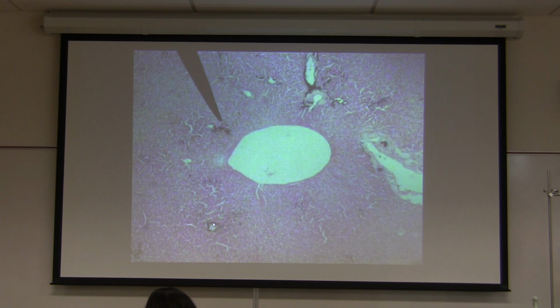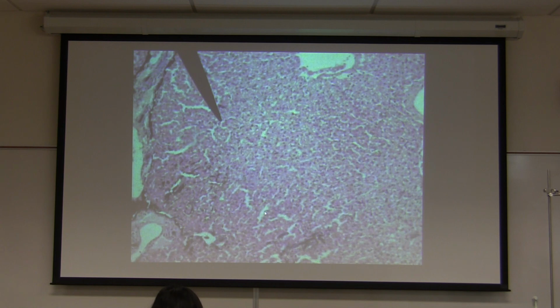Reticular connective tissue. If you do not write down connective tissue, I will not give you credit because I'll say you meant reticular epithelial tissue. There is no such thing as reticular epithelial tissue. You must write down reticular connective tissue. I hope I'm making some sense. Okay, here is a high magnification, sinusoid, reticular connective tissue. These are not trash, but anyhow, central vein, central vein.